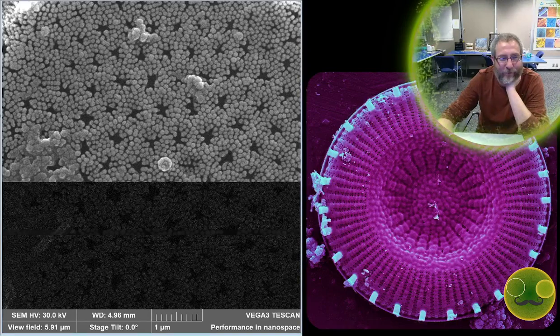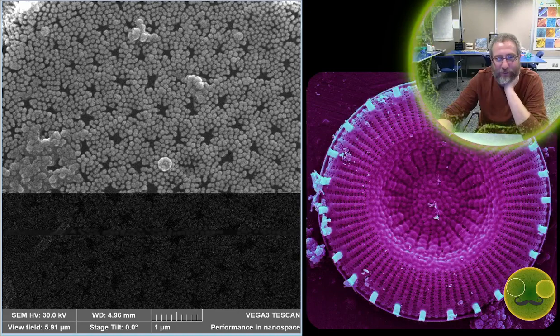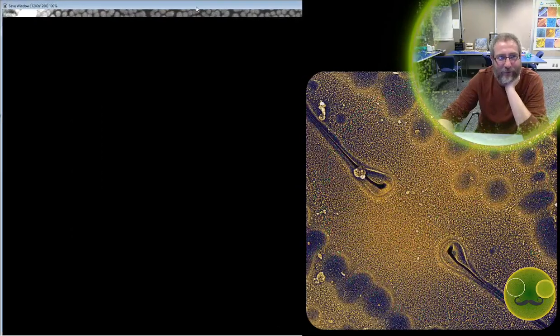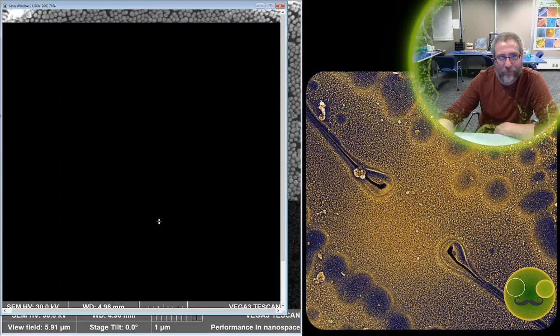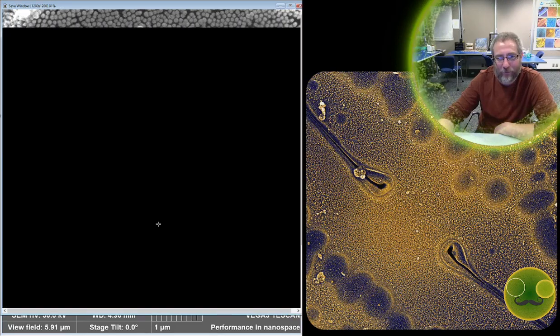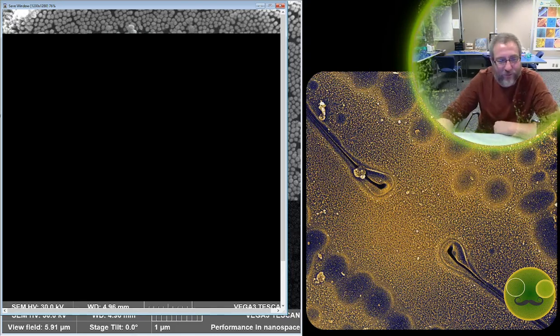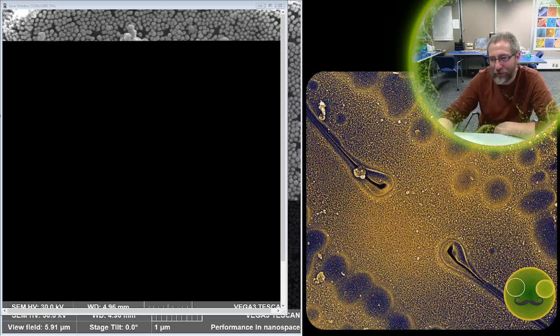And I think that image is going to be okay. So we can at least see the structure. It's a little dissolved or maybe overgrown with silica, one or the other, or some combination. So less than perfect, but that sometimes happens just with diatoms. They don't make their skeletons very strong, not getting the exposure to natural environments.